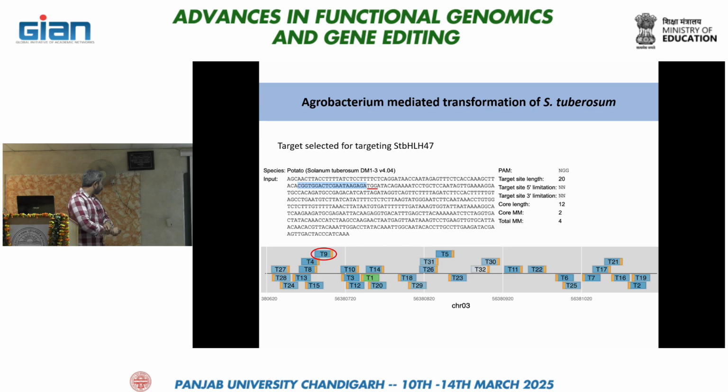So this was our 20 base pair target which we selected, and like Aina told you yesterday, we simply added the BSA1 site in the 5' region, and to the reverse complementary side we added CAAA towards the 3' end. So this was for the BHLH47 part.